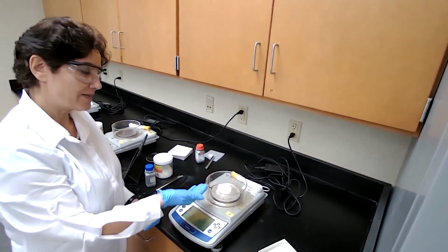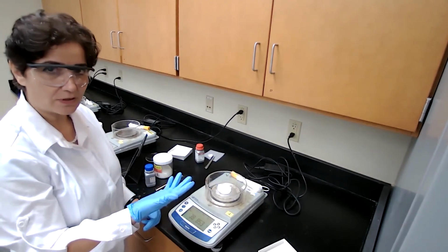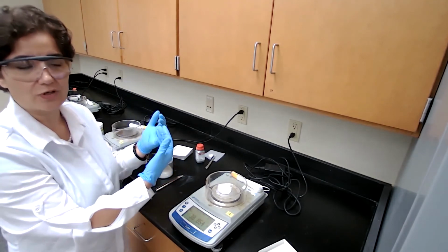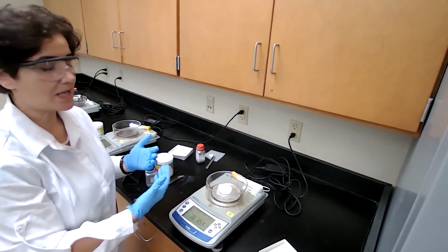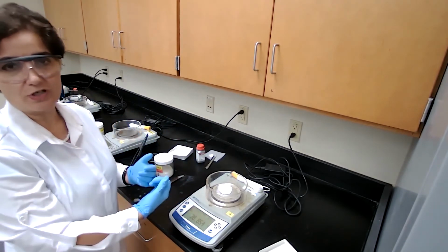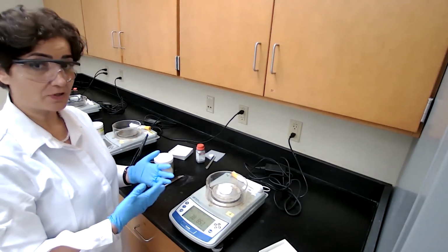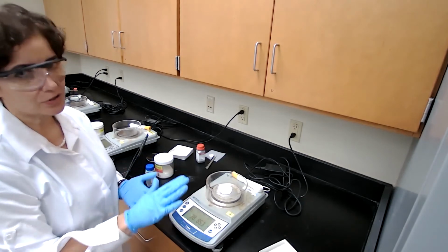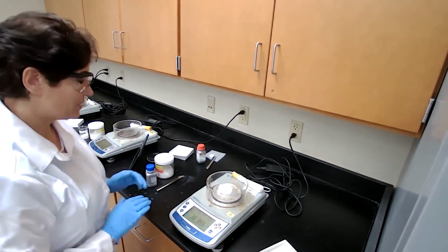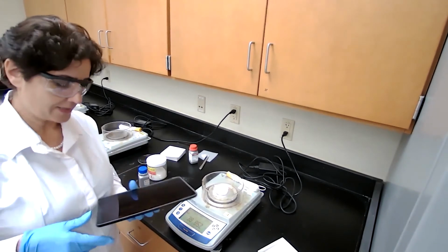Because I measured the mass of the filter paper and the watch glass at room temperature, this has to do with the hot object cooling. One idea, at least, is that as the object is cooling down, it can absorb some moisture from the air. But if you are consistent in the temperature before and after, it should cancel any of the error. Now we have the object. Let's measure the mass and record the mass.